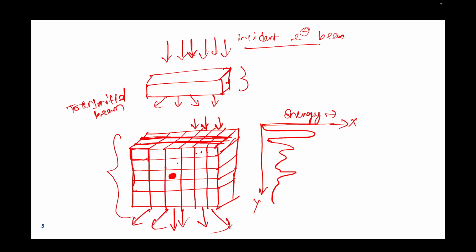And when those things happen, in my image I will not get a uniform material. In this case I might get some dark contrast, and around this dark contrast I will get a bright region.